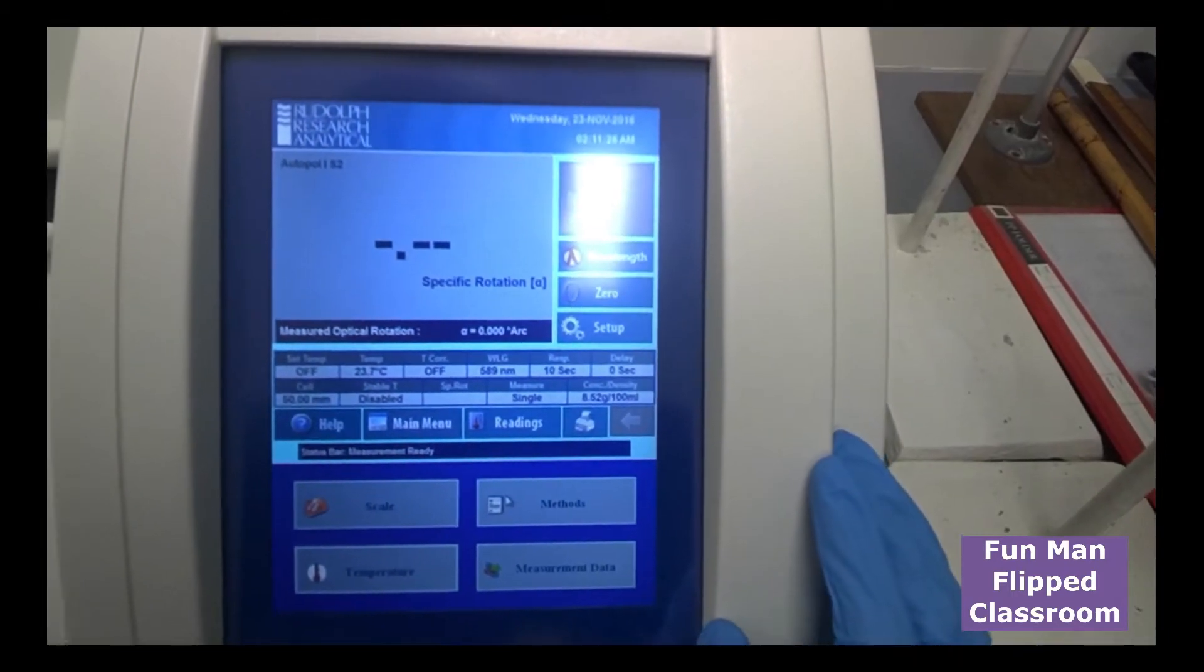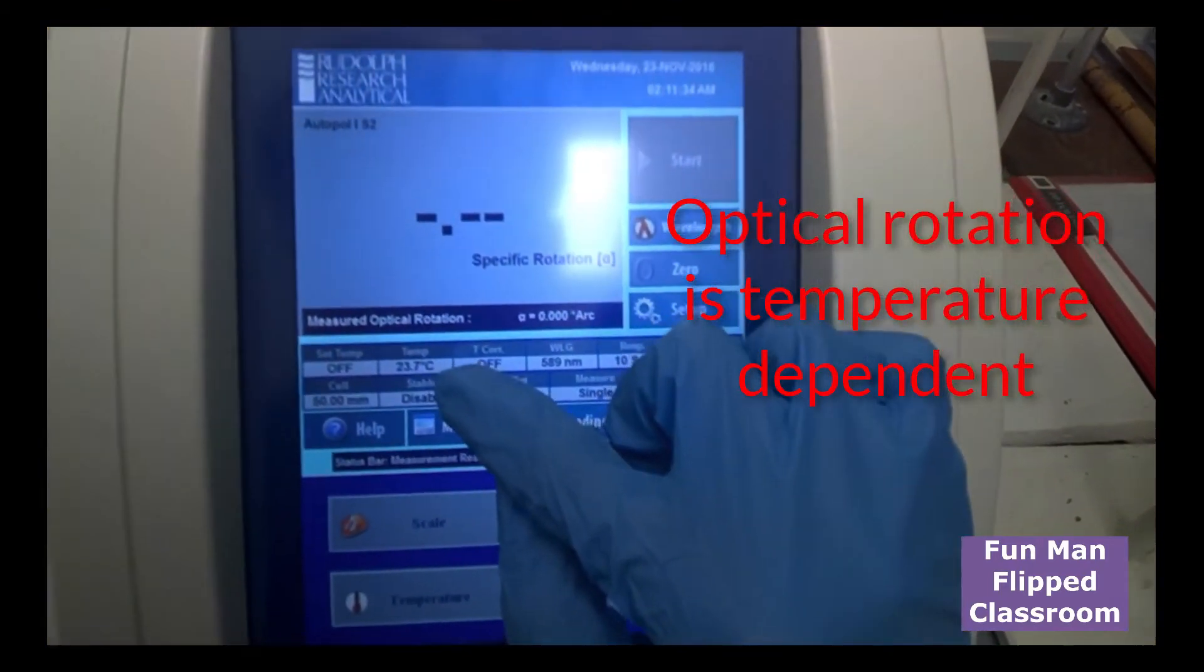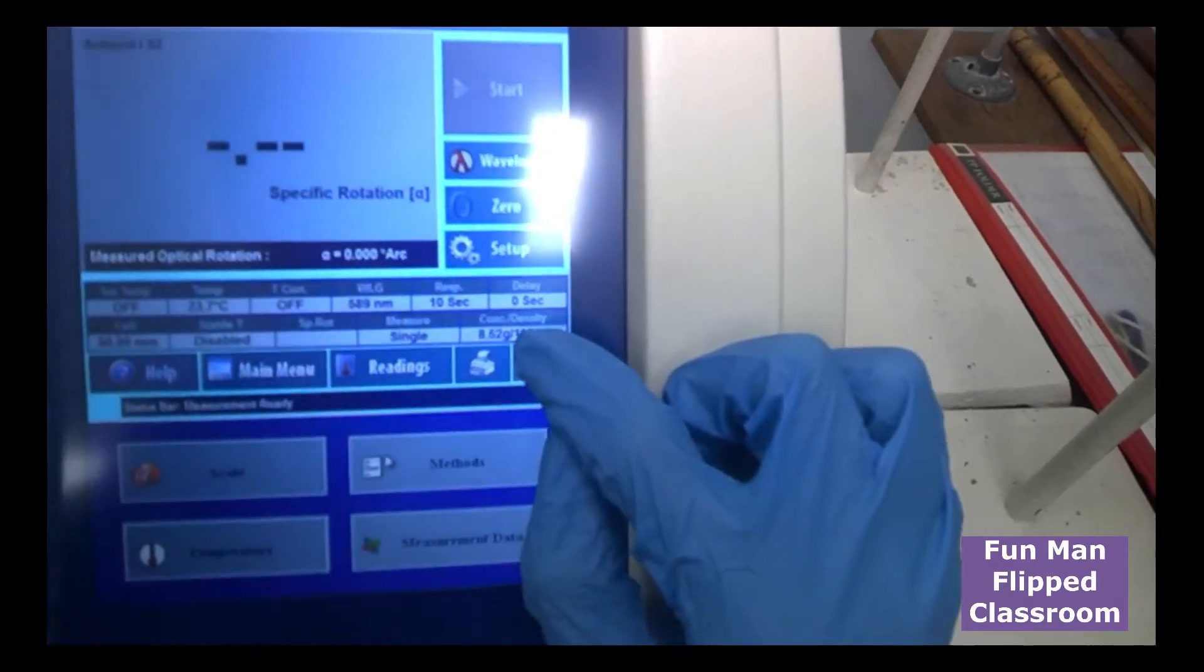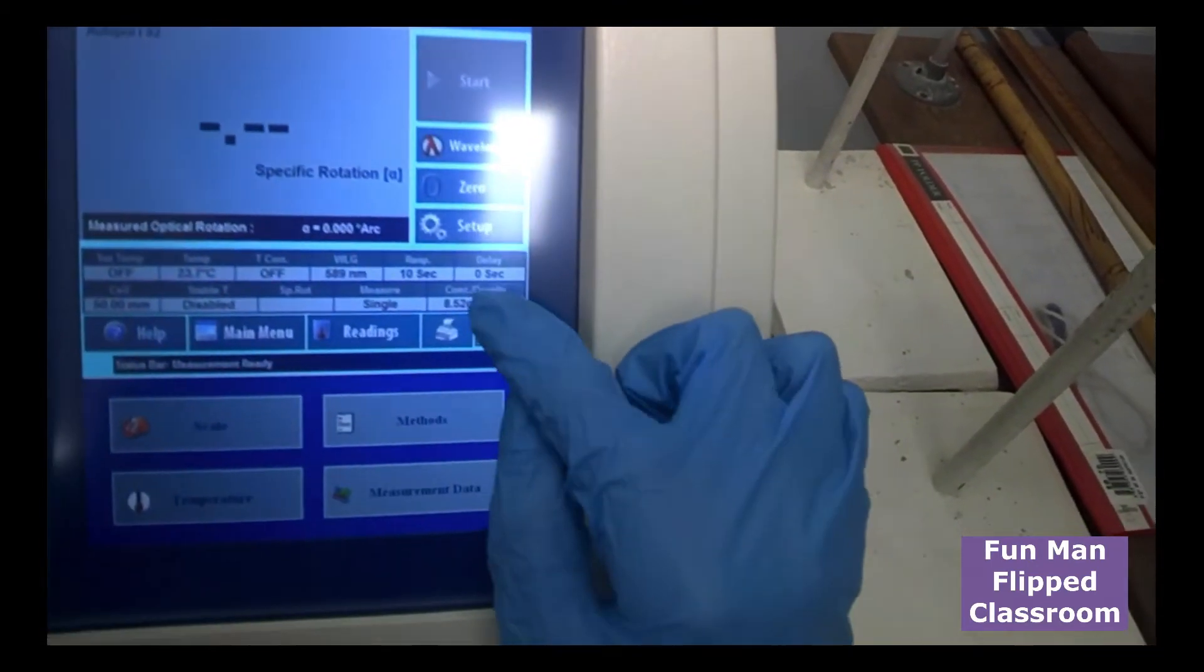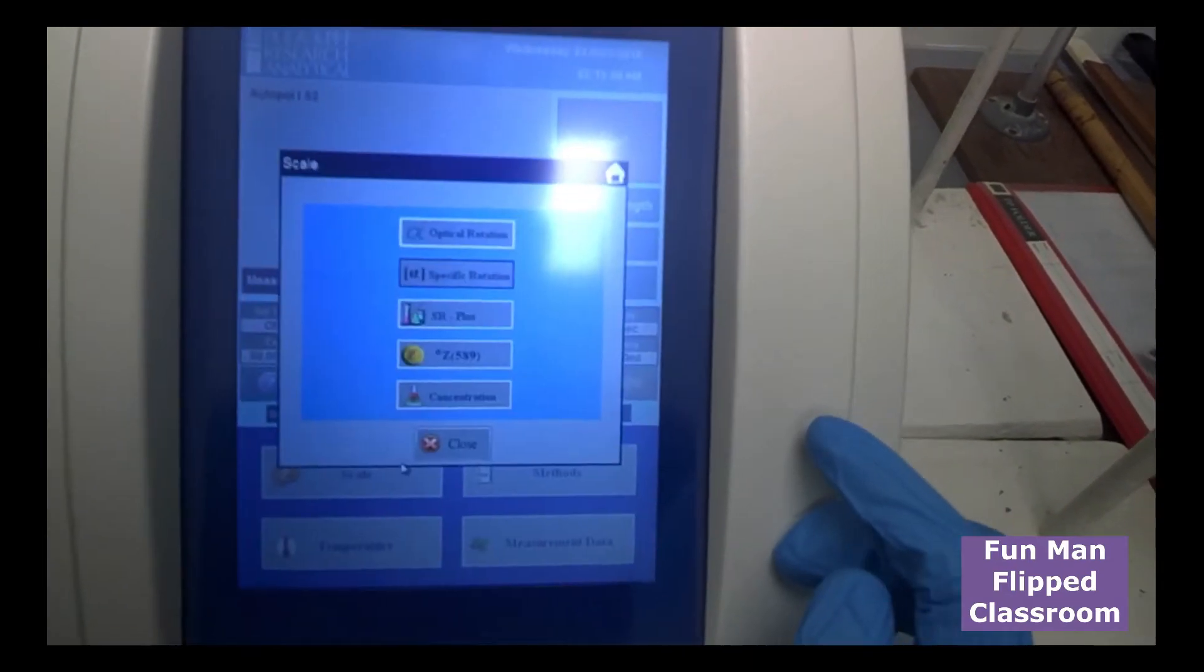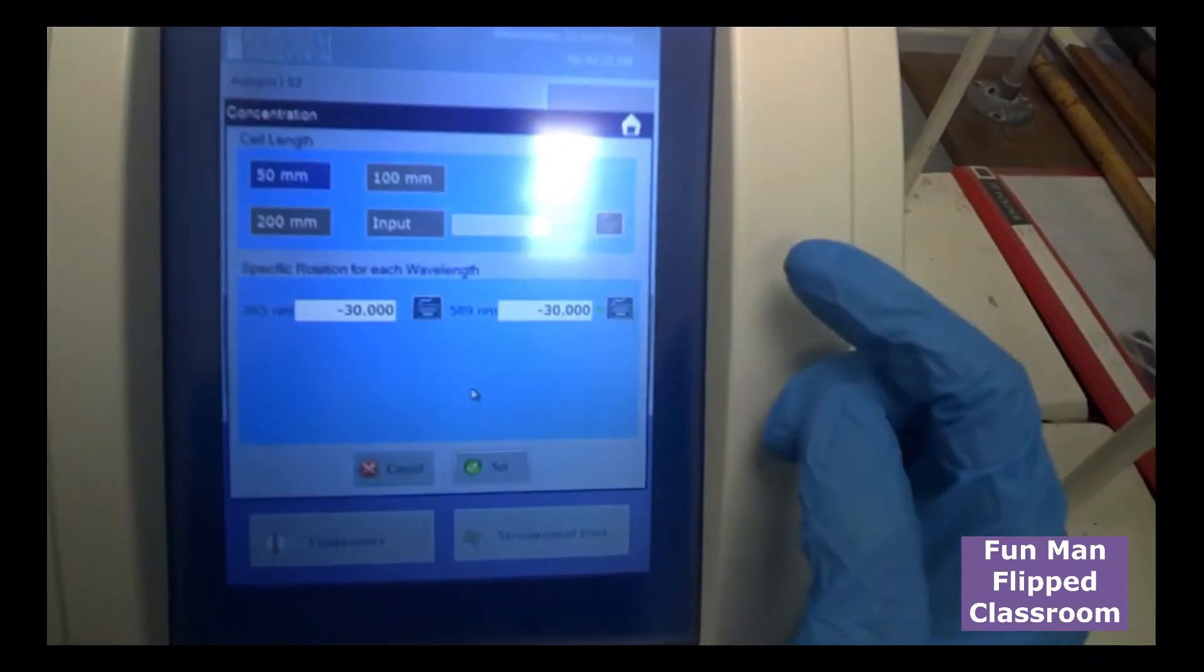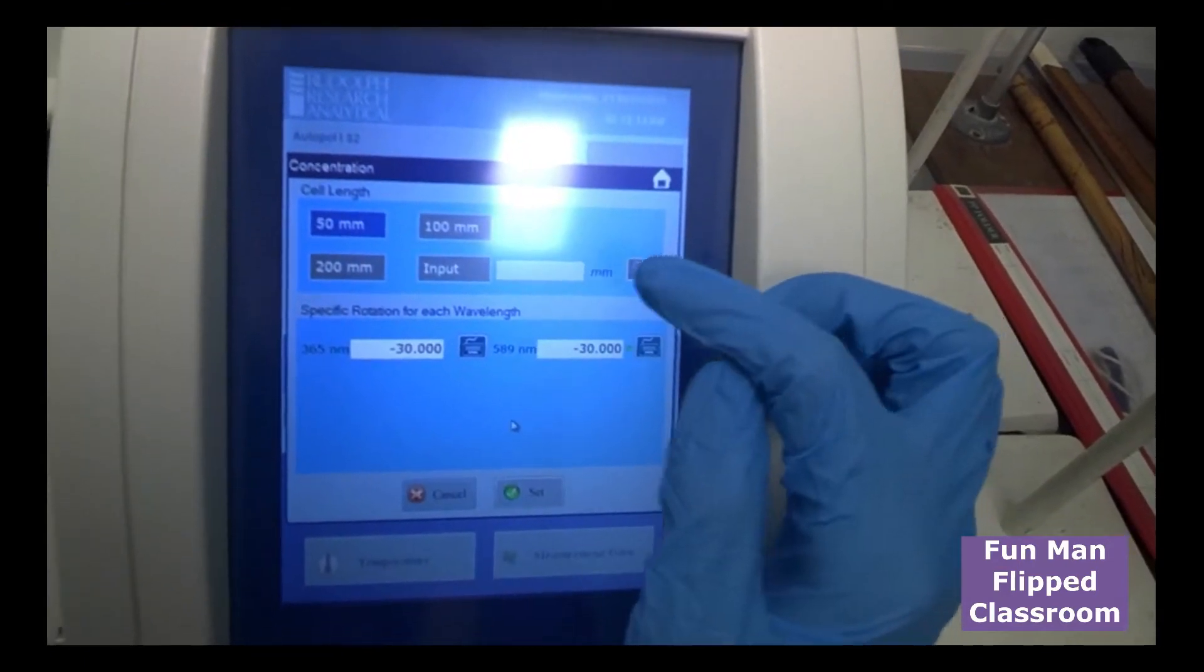Now, we also have the temperature internally. What is the actual temperature inside? Because we know that the optical rotation is temperature dependent. And in this case, you can also adjust the concentration of the solution that you had inside later. You can set this measurement data. This is what is being collected. Scale. Here, we can key in the optical rotation, specific rotation, and the concentration of the sample. So here, we do not adjust anything. But you can key in the cell length. Let me say 5 cm, 10 cm, etc.